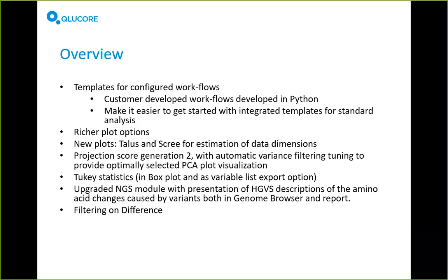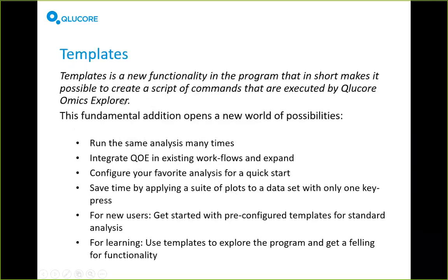So all of these things have gone into 3.5, and the first thing I'm going to talk about is templates, which is the largest addition. It's maybe the largest addition we've done to the program since we added NGS to the software. And this is really exciting because what we're doing here is opening up the program so you can write your own scripts to control the program.